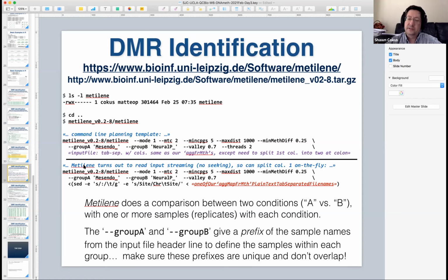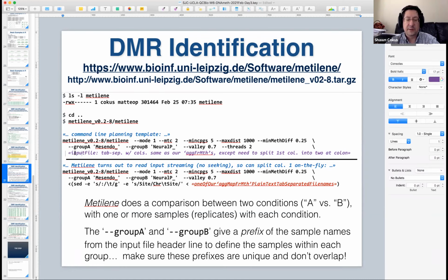And that means we can actually generate this column 1 to 2 column split on the fly. We could make a whole set of parallel files and just have them sit on disk with the 2 column version, but we can just generate the split on the fly. So this is where you would normally put the path name of the input file, and instead we can use the bash shell less-than-parens construct, which means set up a pipe, run this command line, and take the output of it.